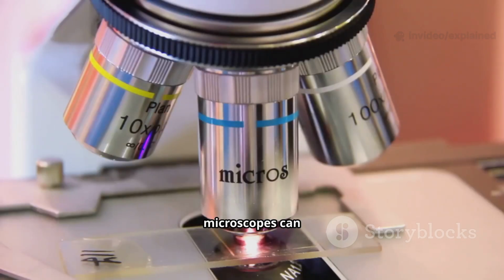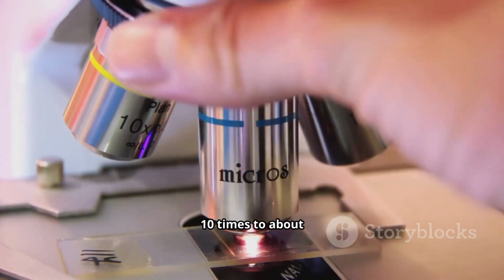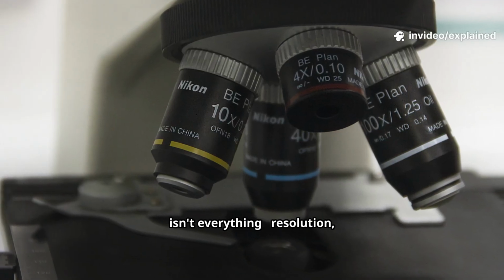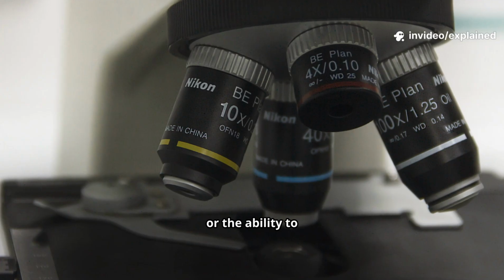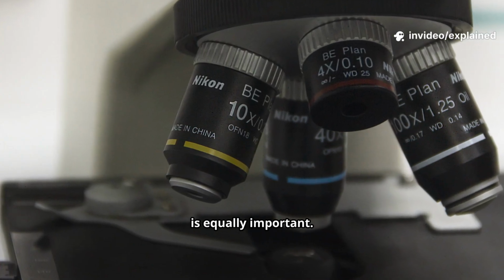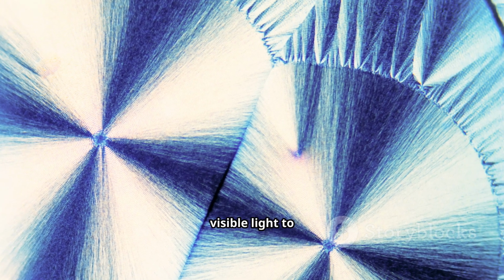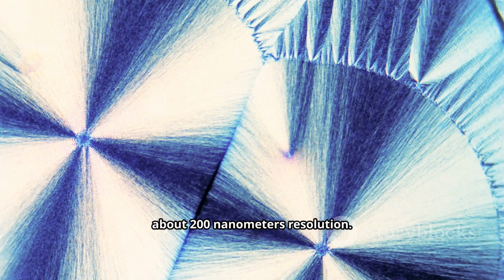Most light microscopes can magnify objects from 10 times to about 1,000 times their actual size, but magnification isn't everything. Resolution, or the ability to distinguish fine details, is equally important. Light microscopes are limited by the wavelength of visible light to about 200 nanometers resolution.